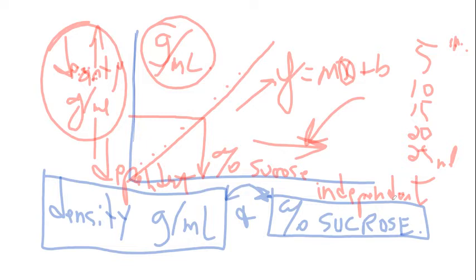And then the last part is that you will have exactly the same plot for your beverage, whichever one you picked. And that will be grams over volume, where the slope of that line will be density as well. So any questions about how we're going to get started?